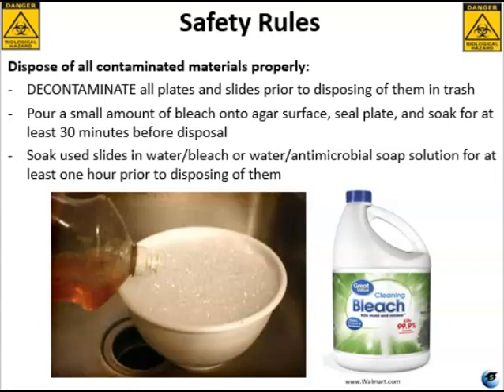For the slides, you want to soak your slides in water that contains either bleach or you can use an antimicrobial dish soap, and let that soak for at least 1 hour. Also, it's best to put the glass slides, after they've been contaminated, in some kind of hard plastic container, or you can wrap them in cardboard or bubble wrap, something like that, before disposing of them in the trash. You want to do that because obviously these are sharps and we're not putting them in sharps containers. So you can make your own sharps container just by putting them in some kind of plastic jug or something like that. Or you can wrap the slides in something that will keep them from breaking when they're in the trash, like cardboard or something like that.